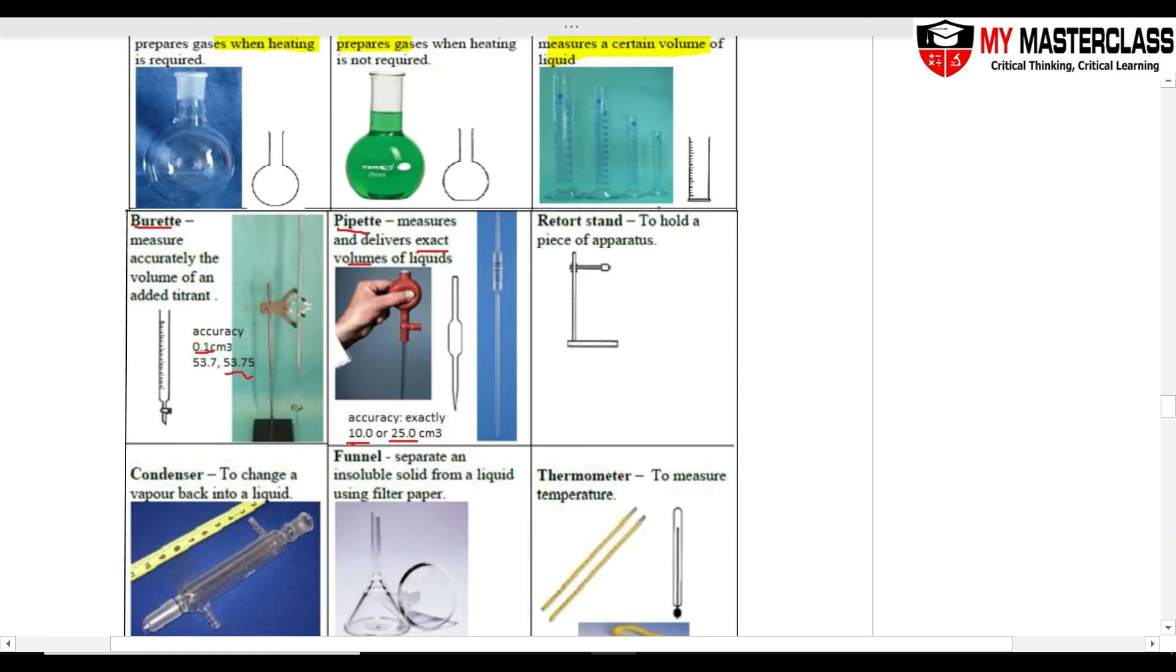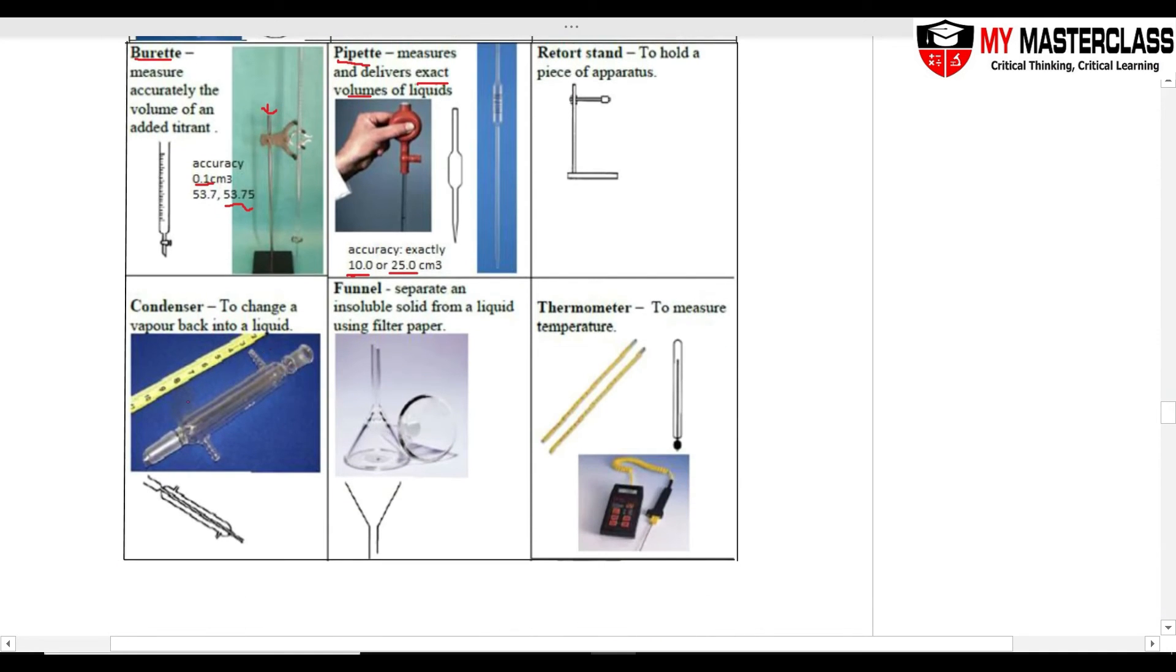A retort stand, this is the long stand that actually clamps the apparatus in. So this whole thing is a retort stand. Condenser, this one in separation technique, simple distillation, you will see it. This one is for vapor, for gases to condense back to liquid.